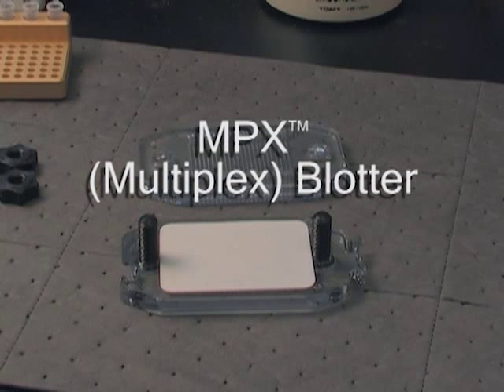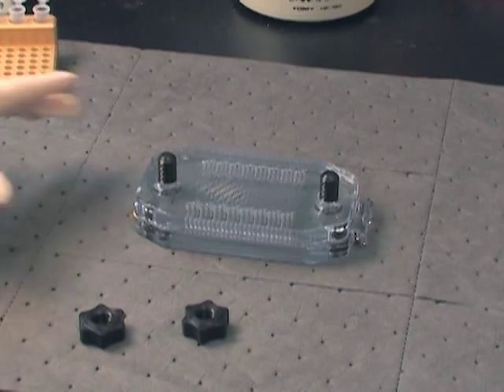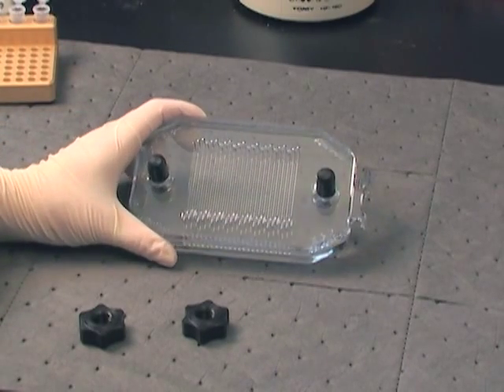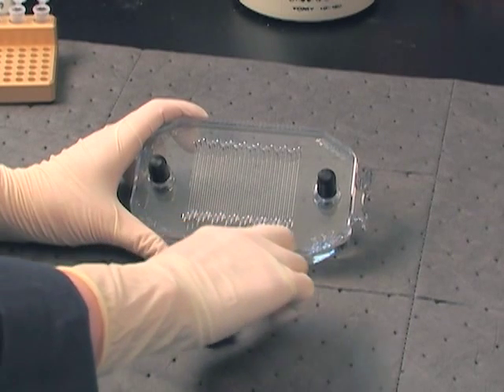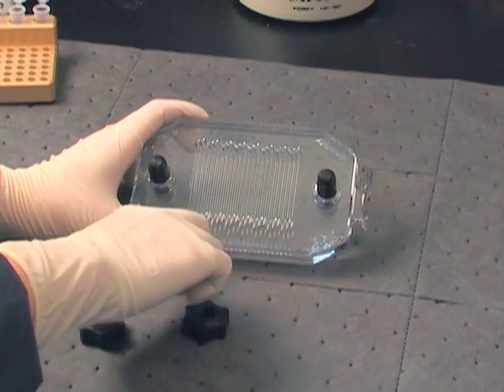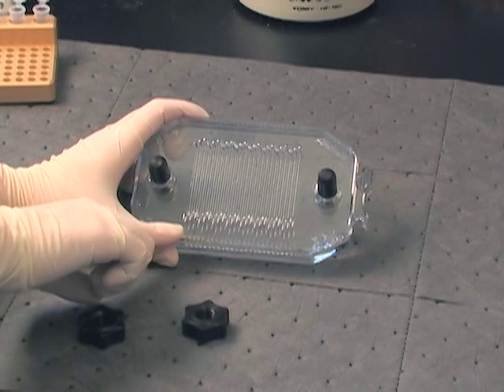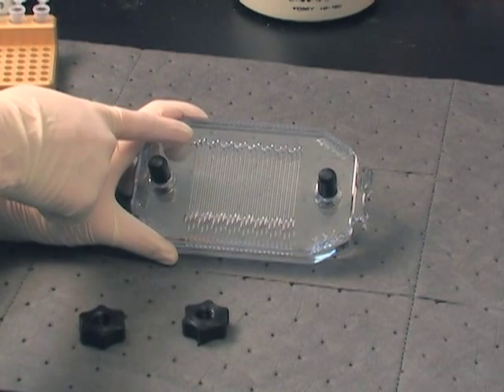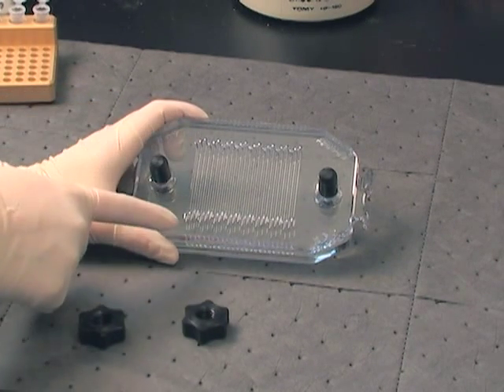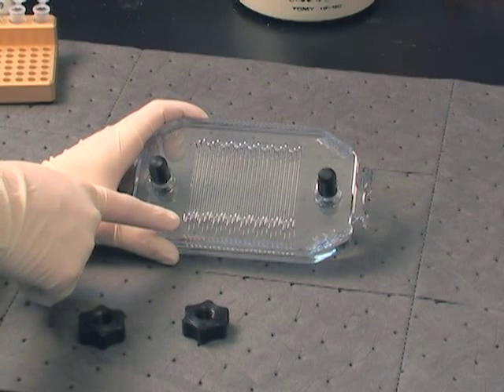The MPX is designed with two types of ports. One is beveled, the other rounded. The ports are compatible with both single and multi-channel pipettes. Orient the MPX so the beveled ports run along the bottom and are closest to you. The round ports at the top will provide a capillary-like flow when filling the channel with the pipette from the bottom beveled ports.